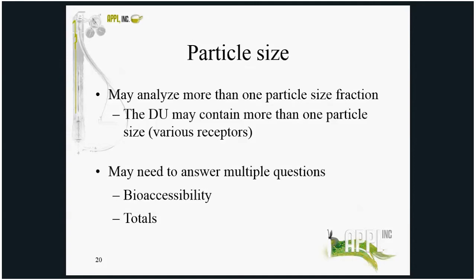Well, you can separate the less than 150 micron portion, run the arsenic and the lead, and recombine the entire sample and process it as if it were a regular soil, going through all the steps necessary, and then analyze the PAHs. If you're looking at lead in a range where nuggets are suspected, and you're looking at the entire soil fraction, grinding is the best way to get a representative sample.